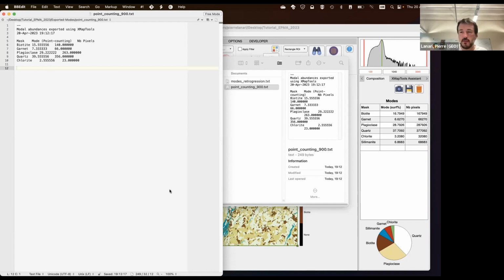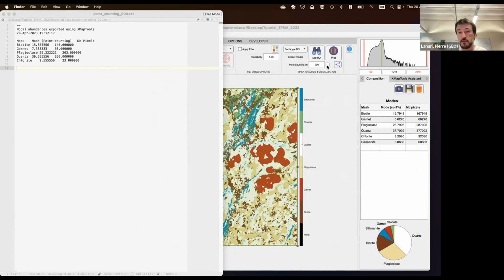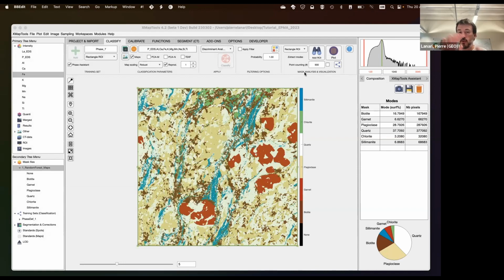You see the difference, and you have quite some variability, especially since if you redo the point counting again, you will get slightly different results because every time the coordinates will be randomly determined. So this was the idea, to show you what you get with this point counting method. I even implemented an uncertainty calculation using Monte Carlo, so you could repeat that sampling technique 1,000 times automatically. That will calculate the precision of your point counting.